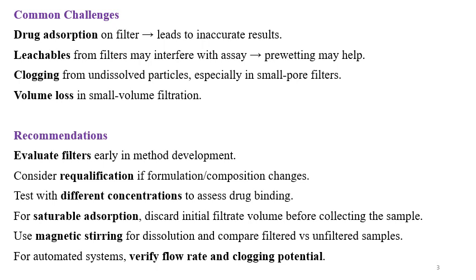Now, what are the recommendations? Evaluate the filters early in the method development. Also, I will recommend once you finalize your formulation, once you finalize your method, once again go for evaluation of the filters, and also you can check the previously selected filters once again so that there will not be a bias. Then consider requalification if formulation composition changes or method changes are there, as I have mentioned.